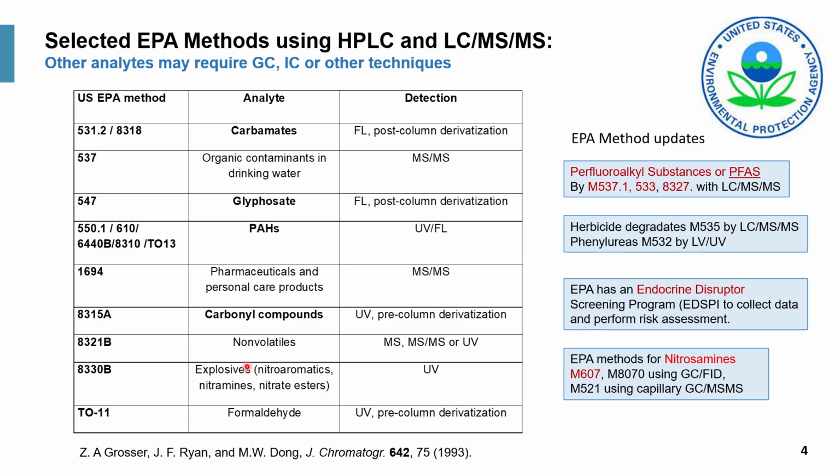I'd like to point out one paper that PerkinElmer authors have published, a very extensive documentation and white paper on regulation and also all the HPLC methods in EPA, that was published in the Journal of Chromatography in 1993. And the authors are from the environmental department of PerkinElmer at that time.